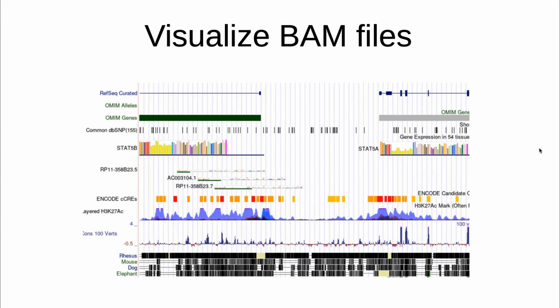Hi, in this video I will show you how to visualize BAM files in a genomic context. This is a fragment of the UCSC genome browser, and here in blue there are hills and mountains generated one way or another by using BAM files.